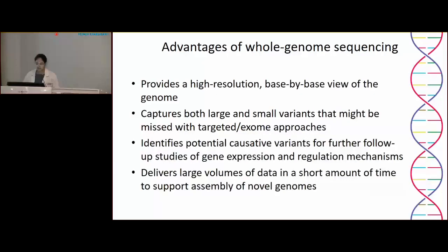The advantage is that it provides a high resolution base by base view, and captures both large and small variants that might be missed with targeted and exome approaches. It can identify potentially causative variants for further follow-up studies, and it can also be used for assembly of novel genomes.